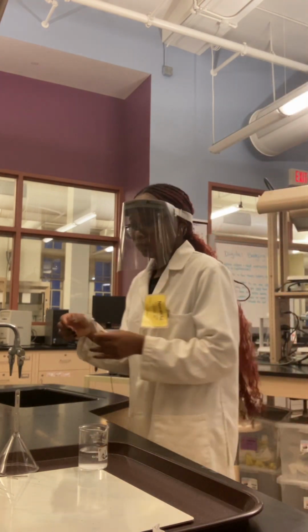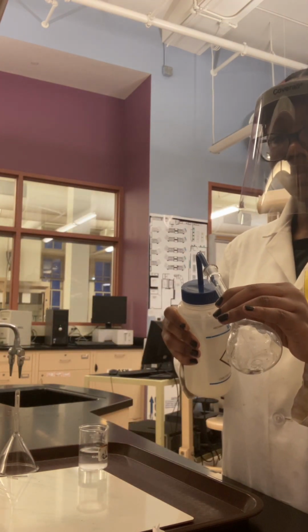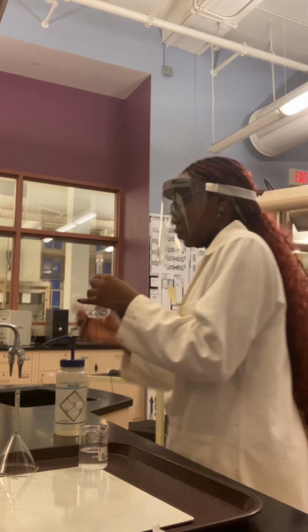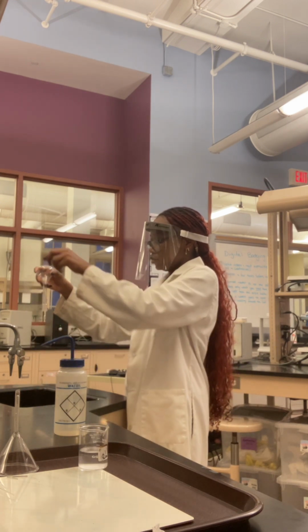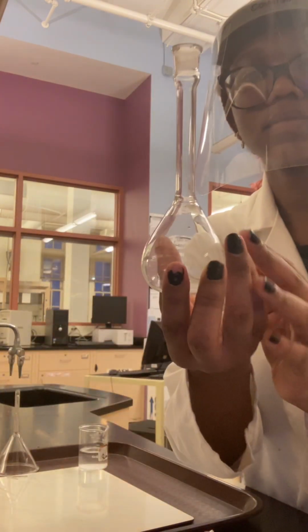So first I'll use my wash bottle to rinse my volumetric flask. And so this is my rinsed out flask.